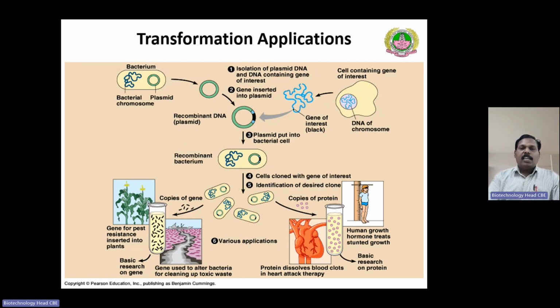So we have seen in detail the construction of recombinant DNA and bacterial transformation. You will also get to see the different applications this recombinant DNA technology has. In summary, from a host, you can isolate the plasmid from the bacterial cell, and it can be treated with a restriction enzyme to cut it open.